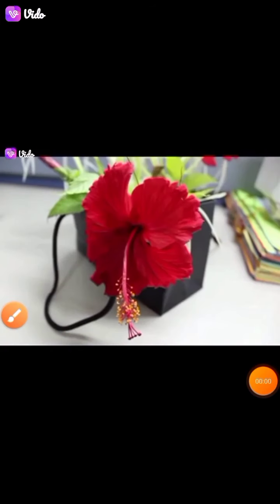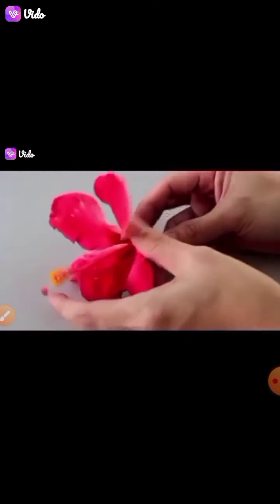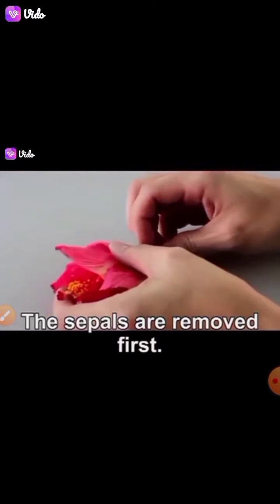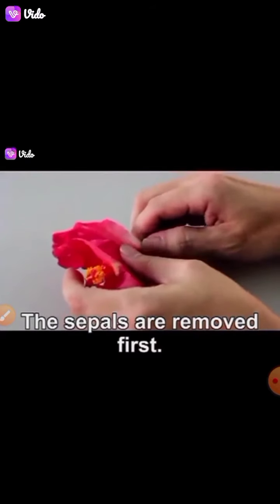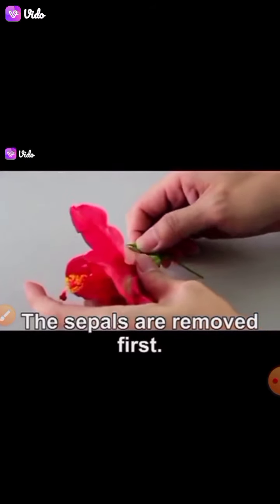whole flower. So let's see the dissection of a hibiscus flower. We will see how the hibiscus is dissected. Firstly, we remove the outermost non-essential whorl of sepals very carefully, slowly, without disturbing any other parts of the flower.